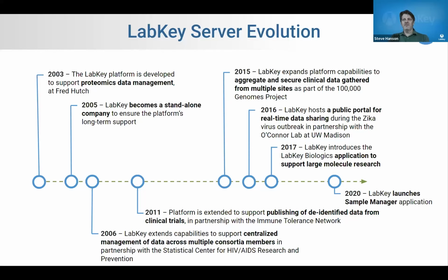The very first problem that ever came through the door was a proteomics researcher. This researcher just had too much data. It was hard to manage all the proteomics data, and they didn't know what to do with it, where to put it, or how to structure and order it. Well, we built a proteomics tool for that user. And that tool became the core of the MS2 module that's still in the server today.